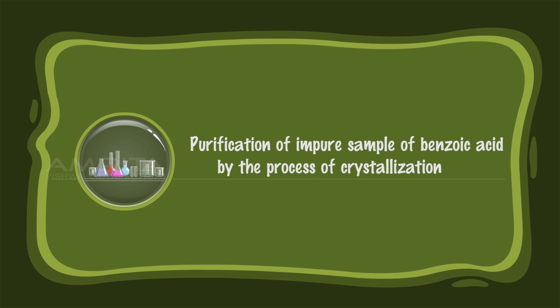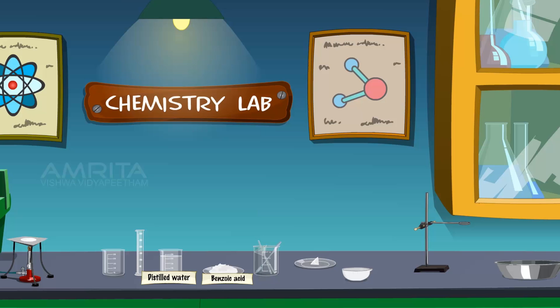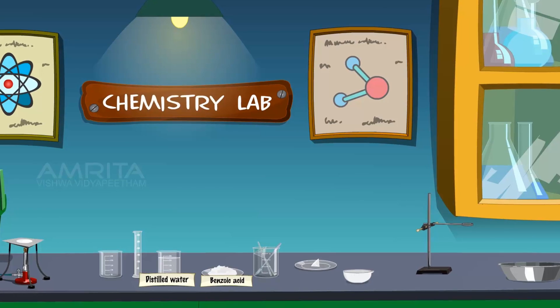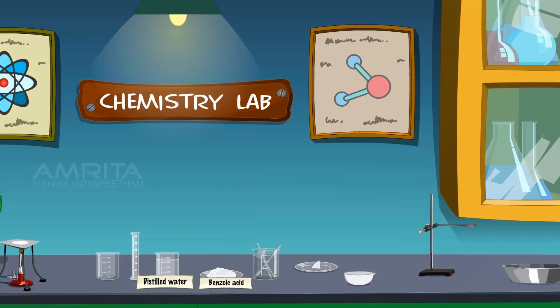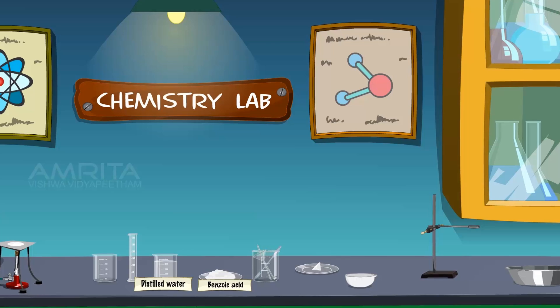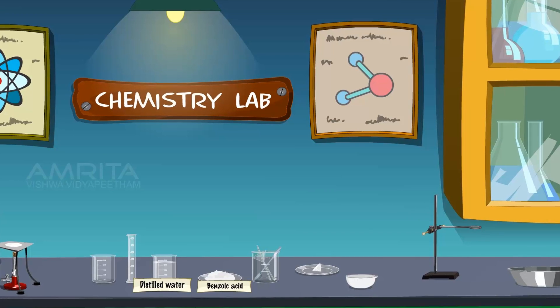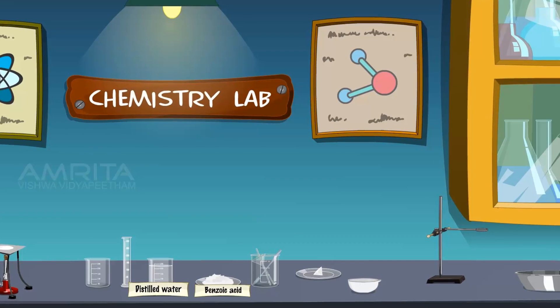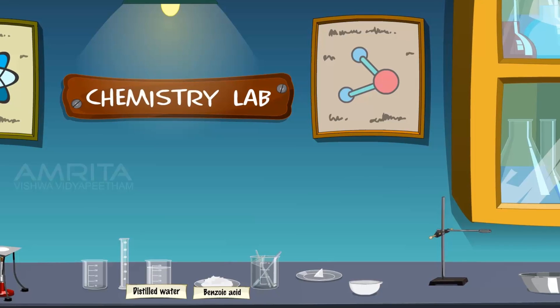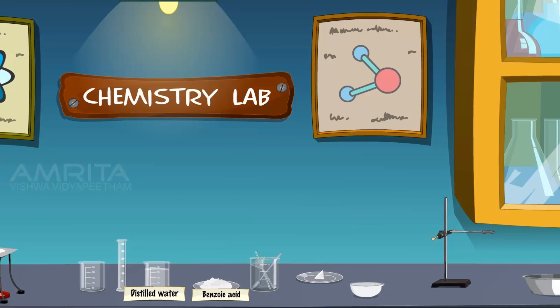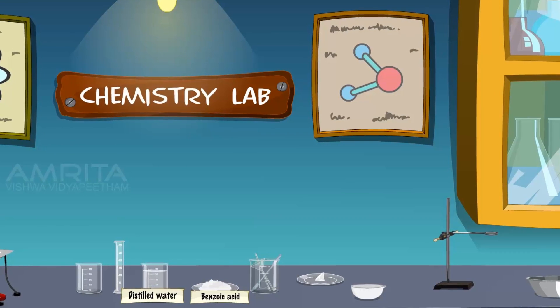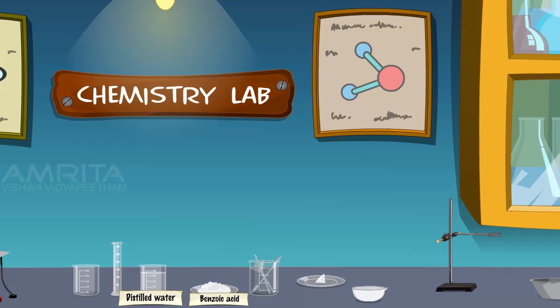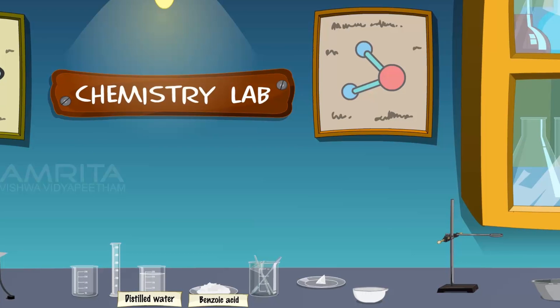Purification of impure sample of benzoic acid by the process of crystallization. We require: crude sample of benzoic acid, distilled water, beakers, measuring cylinders, spatula, glass rod, china dish, fluted filter paper, funnel, filter paper, iron stand with clamp, trough, wire gauze, tripod stand, Bunsen burner, etc.